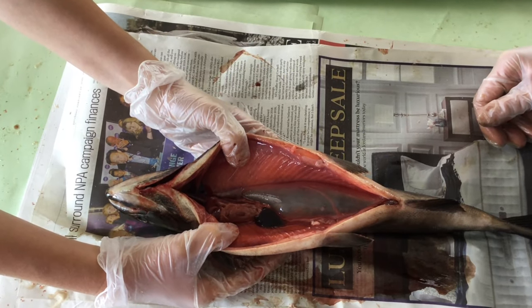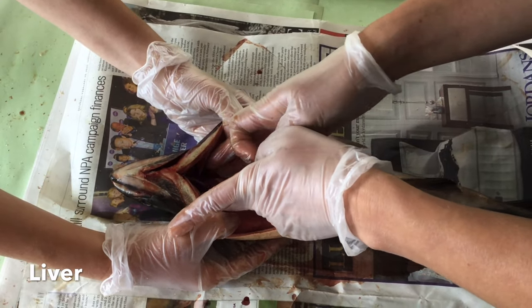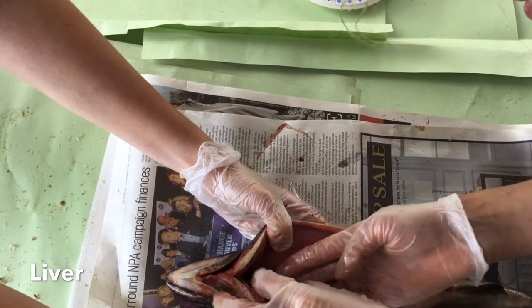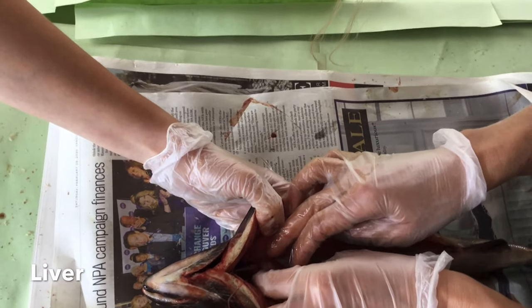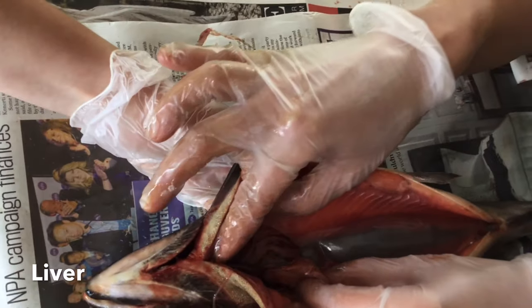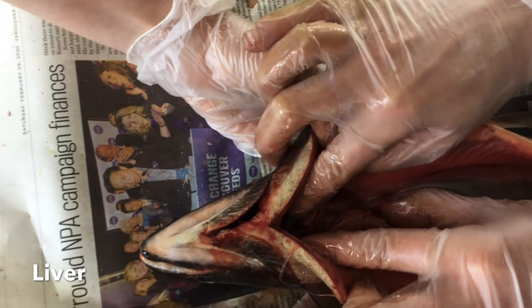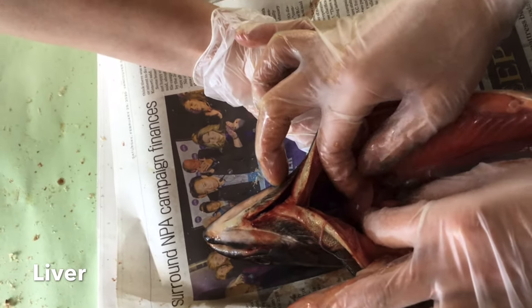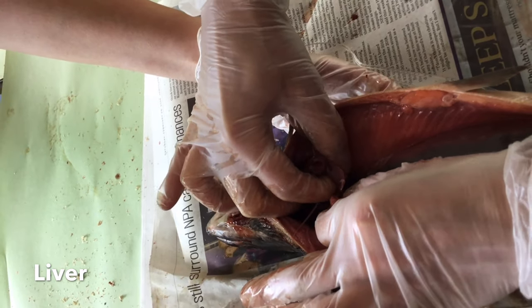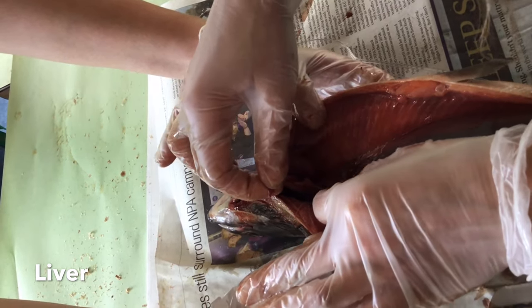Okay, the next thing we're going to go to is the liver. We're going to find the liver. Pull that out. And the gallbladder may also be attached to the liver, or it may be nearby. It's a little hard to get. You have to work for it, right?